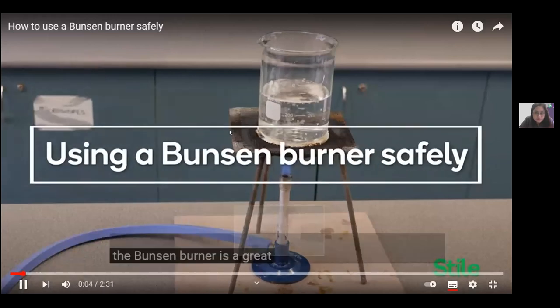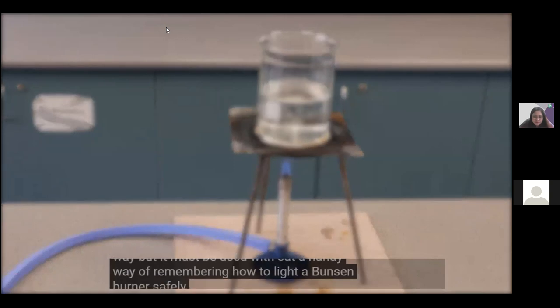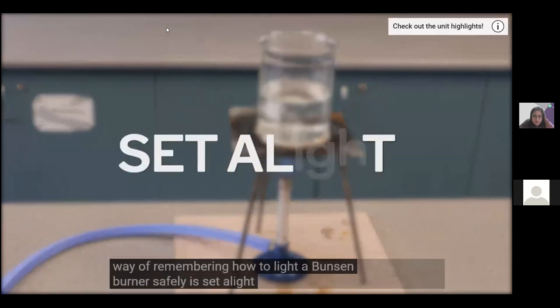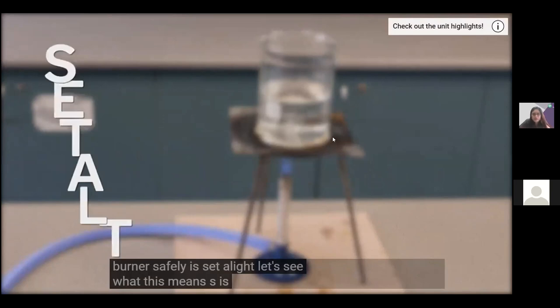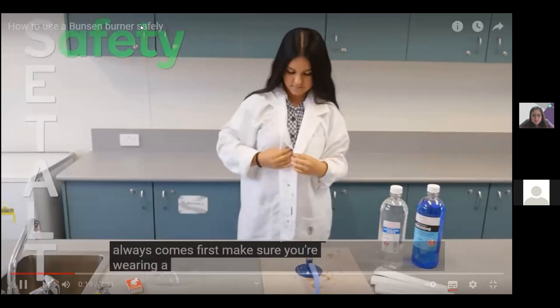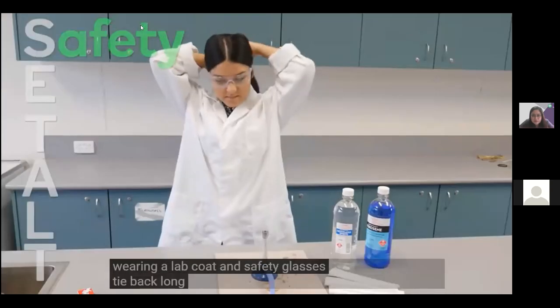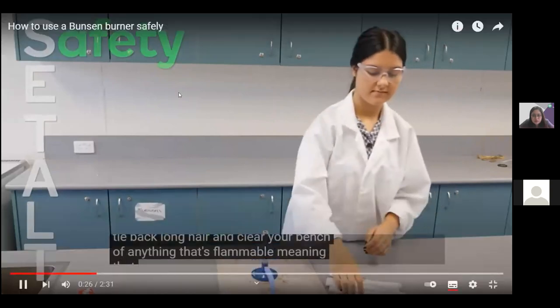The Bunsen burner is a great way of heating up substances in a controlled way, but it must be used with care. A handy way to remember how to light a Bunsen burner safely is the acronym SET ALIGHT. S is for safety, which always comes first. Make sure you're wearing a lab coat and safety glasses. Tie back long hair and clear your bench of anything flammable.